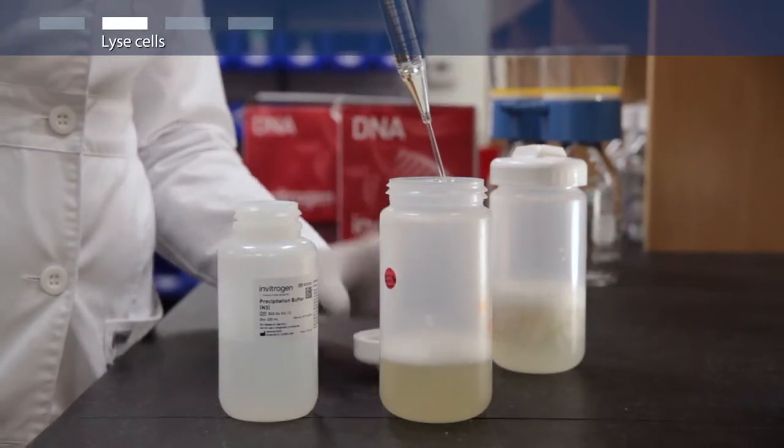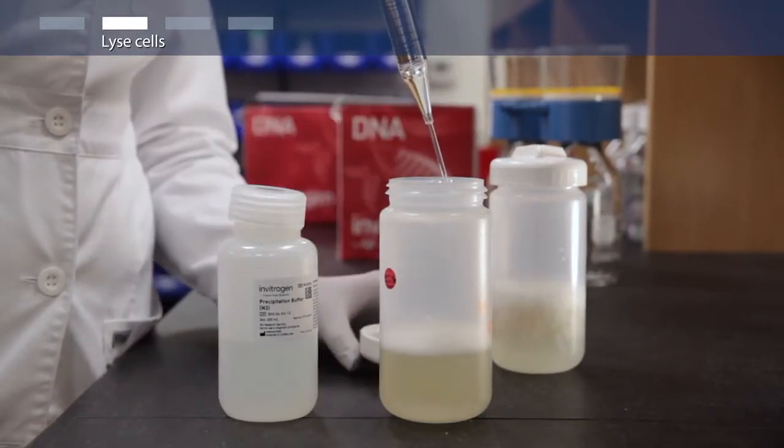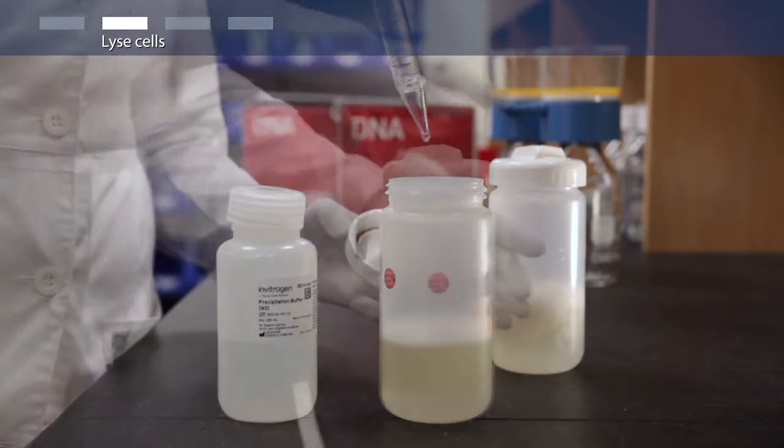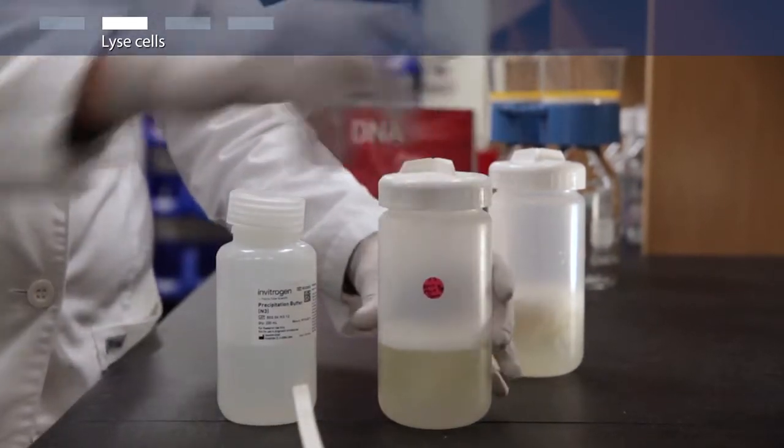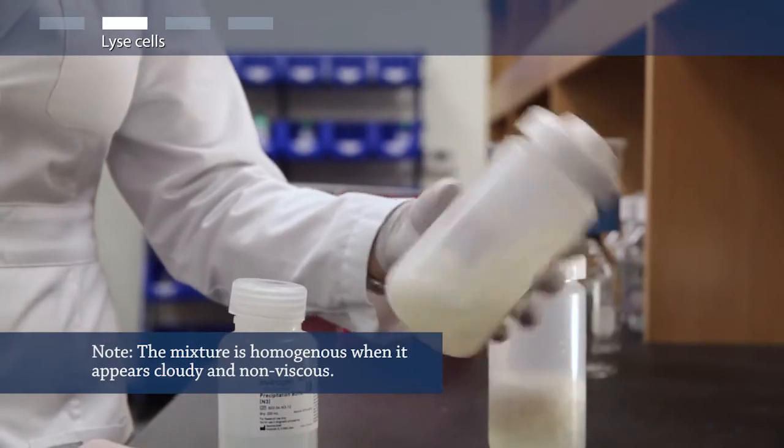Add 50 milliliters of precipitation buffer and immediately mix by inverting the tube until the mixture is homogeneous.